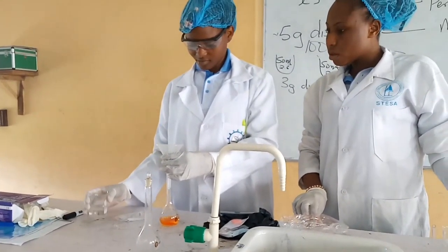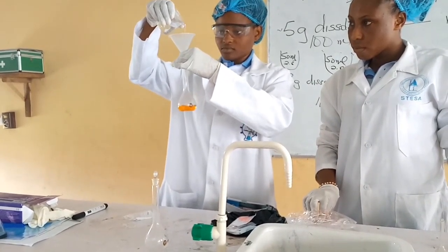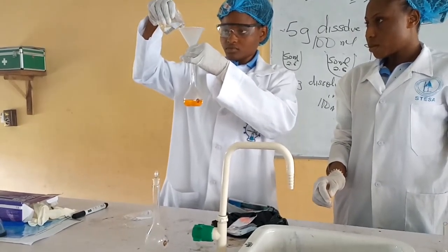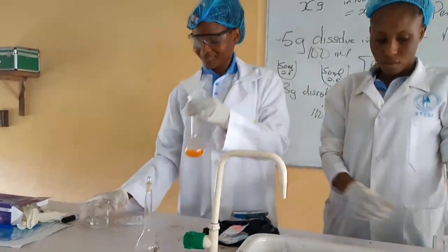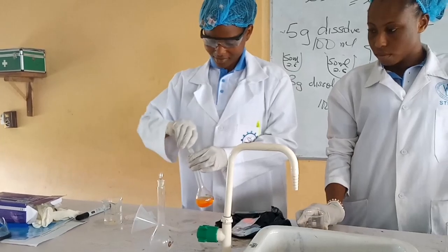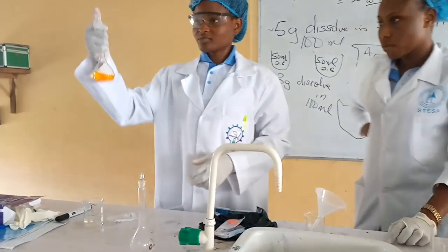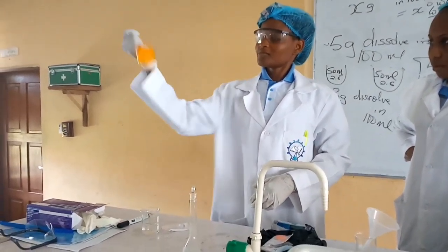Now, she has rinsed that one in. She wants to rinse the funnel also because part of it can remain. And she's not pouring too much water, because some of us, the water will come over. Till she's okay with that. Now, she wants to shake and make sure everything goes into solution. Before she eventually does, now that she's doing that, she's covering that lid.